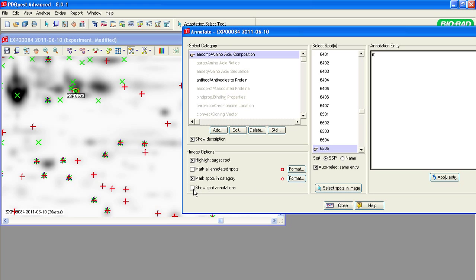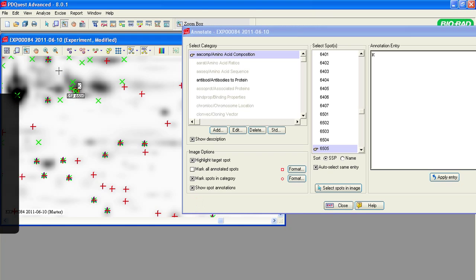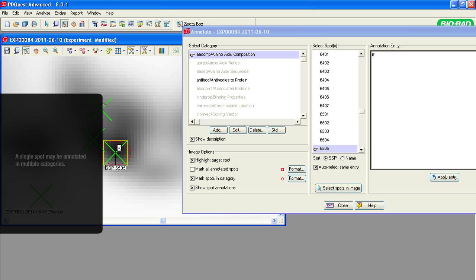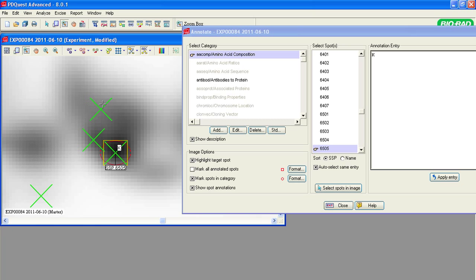To view the annotations on the gel image, select Show Spot Annotations in the Image Options list. A single spot may be annotated in multiple categories. For example, we can create a URL category and add an annotated spot to that category.